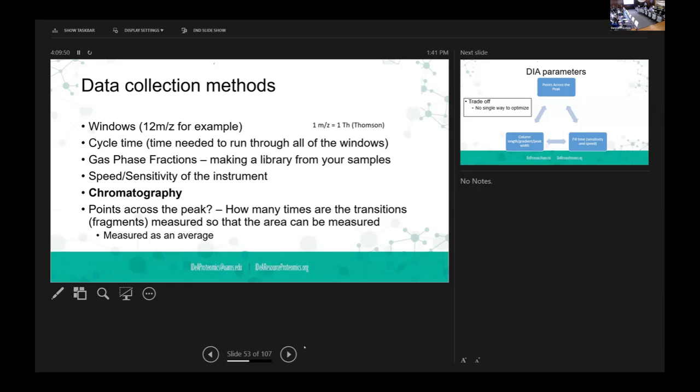Well, and that creeps into our conversations here, and we'll talk about this more tomorrow when we talk about managing. One of the best things I think we're doing is pushing the consults and the sample lists and what contrasts you want. You're not just sending us the samples and saying, when I see the data, we'll figure out what we're doing after you run it. No, because there's too much at stake.